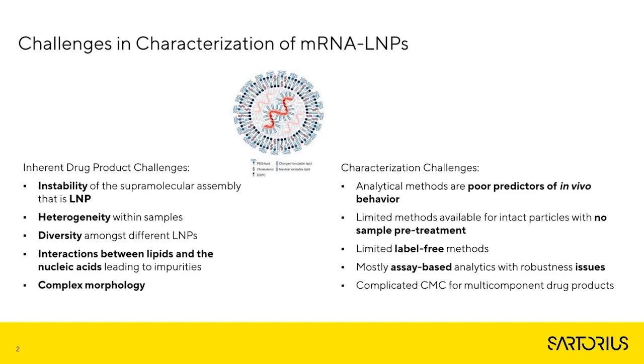And that brings about the heterogeneity, which is a consequence of that, but is also a consequence of other factors on the molecular level. It's also a consequence of the stability and the storage of the samples. And because these LNPs are very modular, you can change out the ionizable lipid, you can change the lipid composition, and so on. That brings about diversity; you can bring about subspecies of different LNPs, so to say.